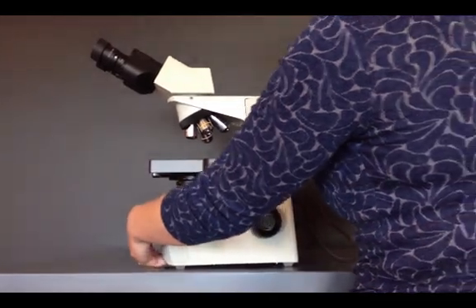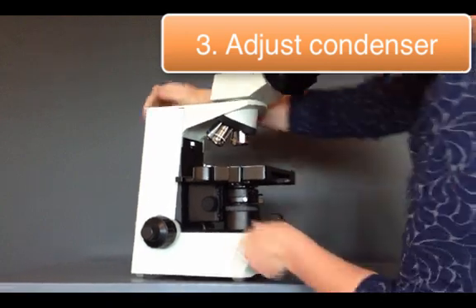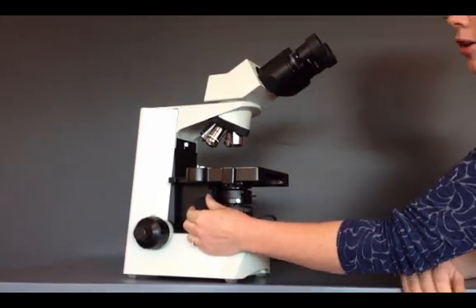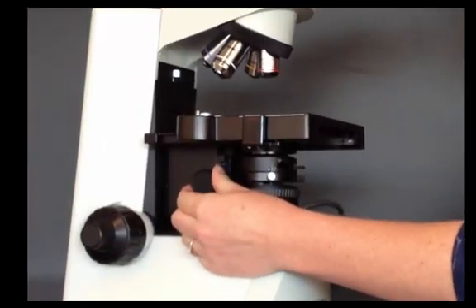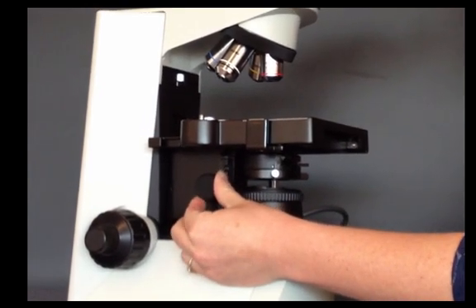Then you need to look at the other side of your microscope at the condenser knob right here. You need to make sure that the condenser is all the way up and then slightly backed off just a hair.